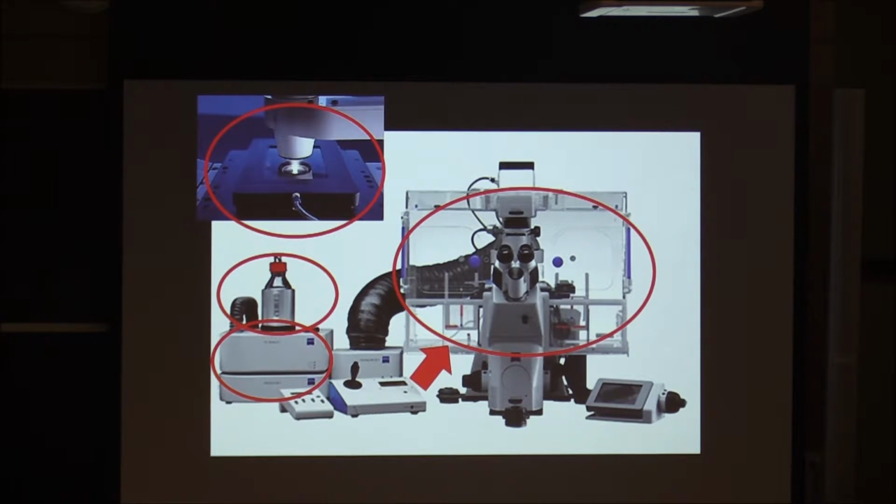And the last thing that is actually not on this microscope, but you'll see it on the one in the facility, there's a little box that sits on the side here. It's a little camera and an LED, and that's what Zeiss calls a definite focus module. This is a focus maintenance module. Other companies have them. Nikon uses perfect focus. So they're all slightly different in the way they work, but the idea there is just to maintain your focal plane within your sample while you're imaging over time. So if there is focal drift in the system, which there always will be, some expansion and contraction, those are going to be corrected for by the focus drive.